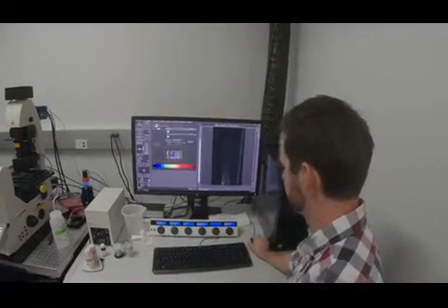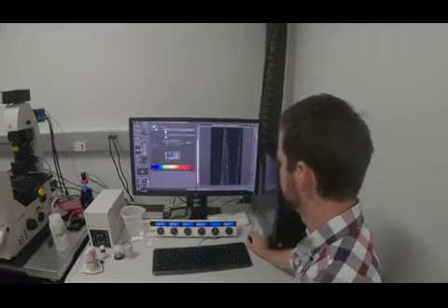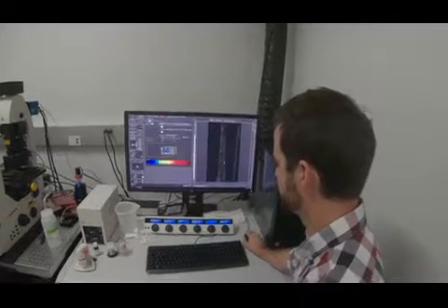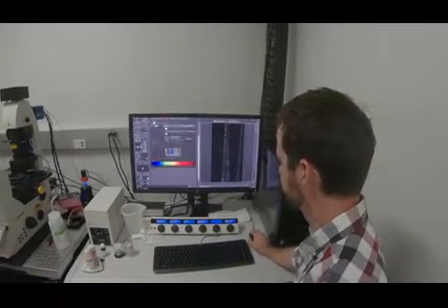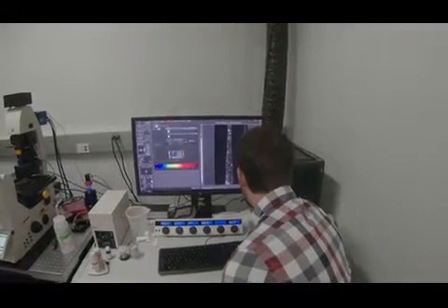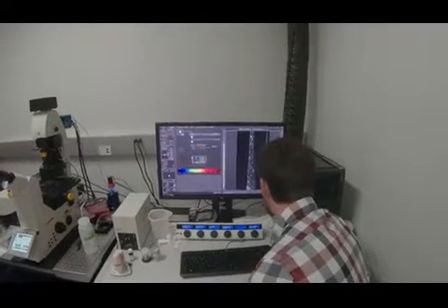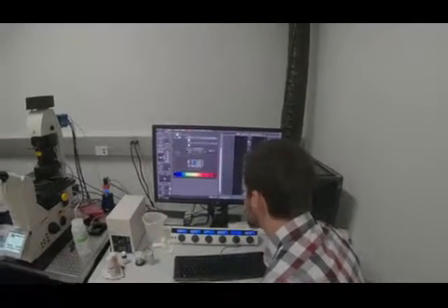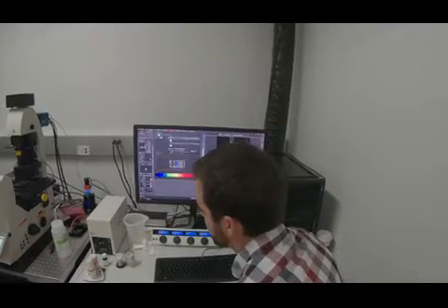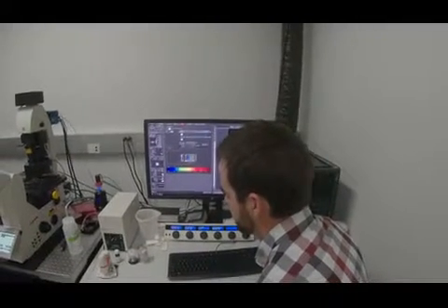So that's the merged image, the Z planes. You have a max projection. And you can remember where you're at, so if you want to go back to one of the previous places you were at to do a different filter, you could do that easily, because your positions are still saved in here.